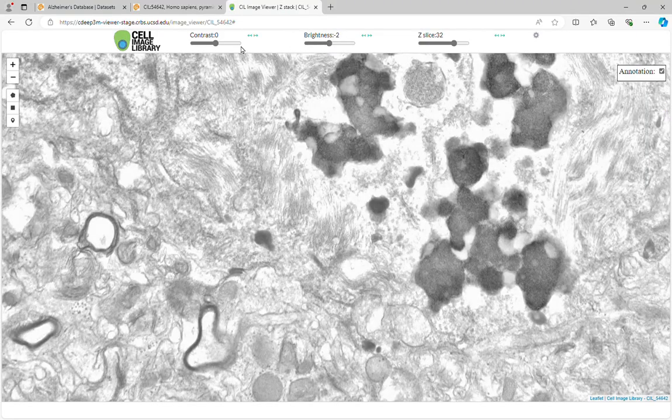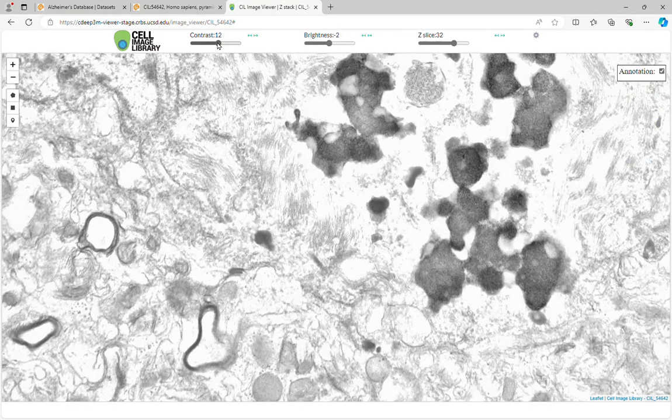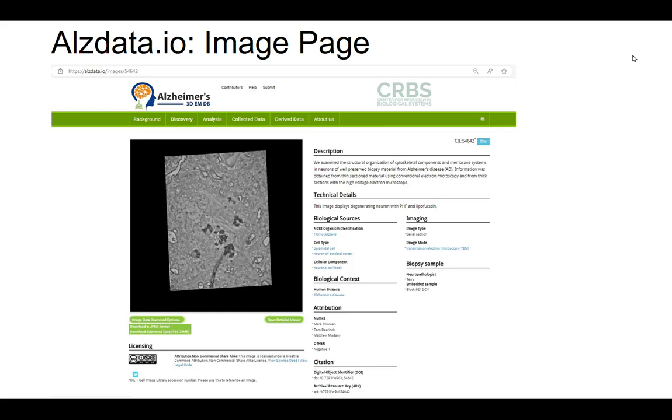In addition, the viewer offers bookmarking tools, which allow you to place pins or draw square or polygon-based boundaries around areas of interest. These bookmarks generate unique URLs that can be shared with other users of the database for collaborative exploration. To download these image datasets, navigate to the Image Data Download Options section found on the dataset's description page. This is the same location where the Detailed Viewer button was accessed.